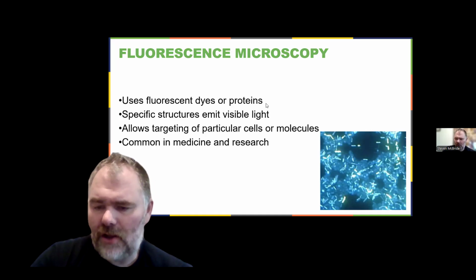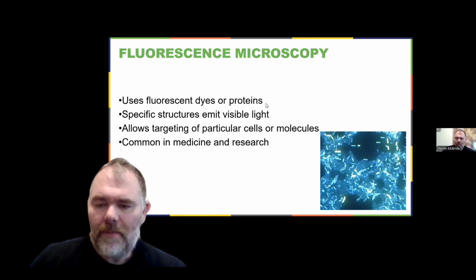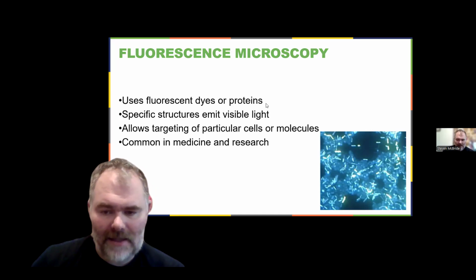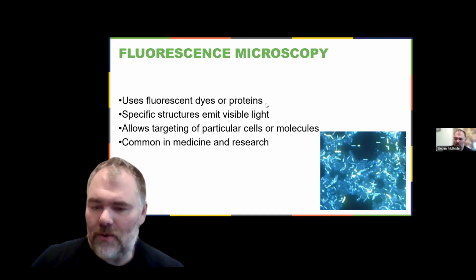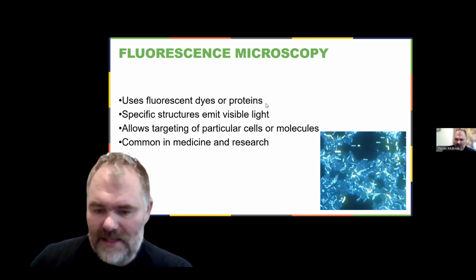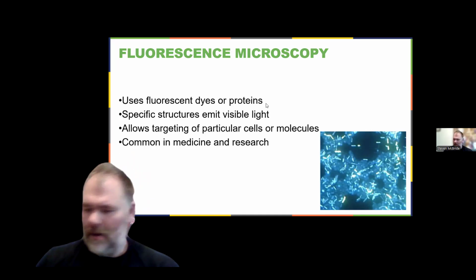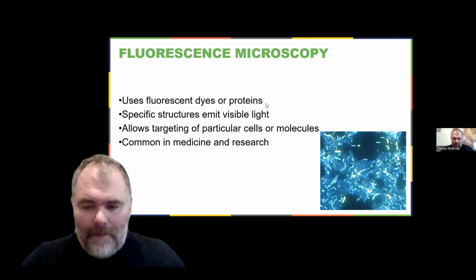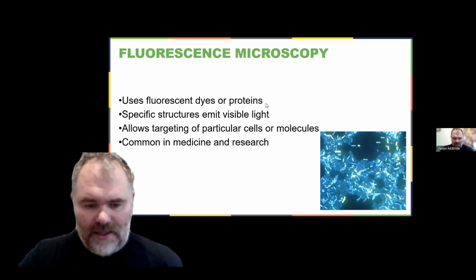In this image, the glowing rod-shaped cells stand out clearly against the dark background because fluorescent stains are labeling the bacteria. Although fluorescence microscopy does not usually have higher resolution than standard light microscopy, it provides something equally important: specificity. Scientists can track particular microbes, proteins, or genes in ways that would otherwise be impossible. Fluorescence microscopy is widely used in microbiology, medicine, and molecular biology research.